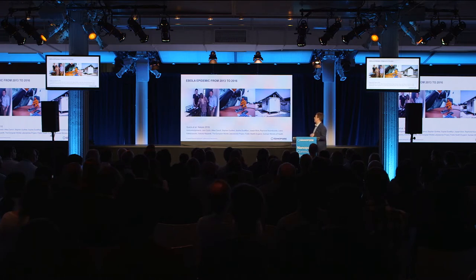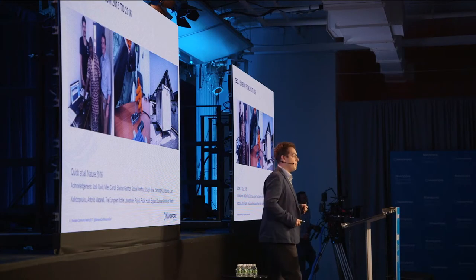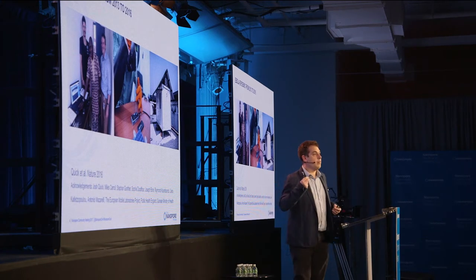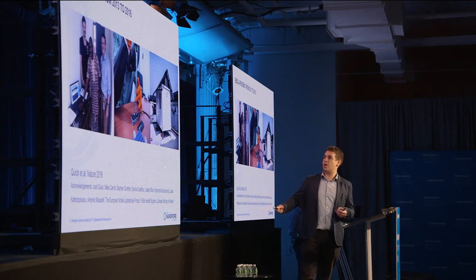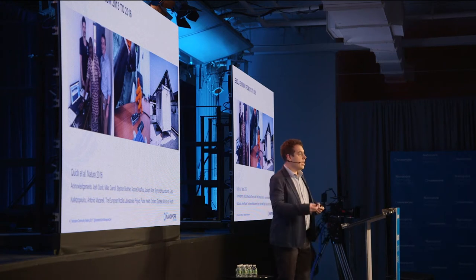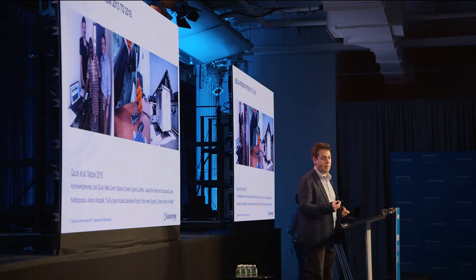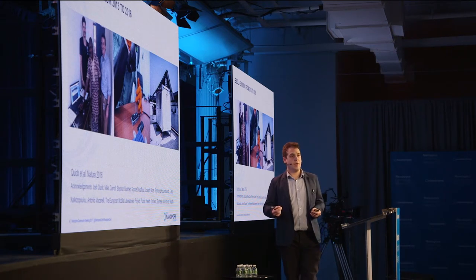So Josh, working with Miles Carroll from Public Health England, working with local Guinean scientists, as Raymond pictured here, working with the Guinean Ministry of Health, we managed to establish several genome centres. This is one of our last genome centres in Nongo, in Guinea, in order to provide real-time sequencing in support of the epidemic response. And what I mean by real-time, I mean genuine real-time.